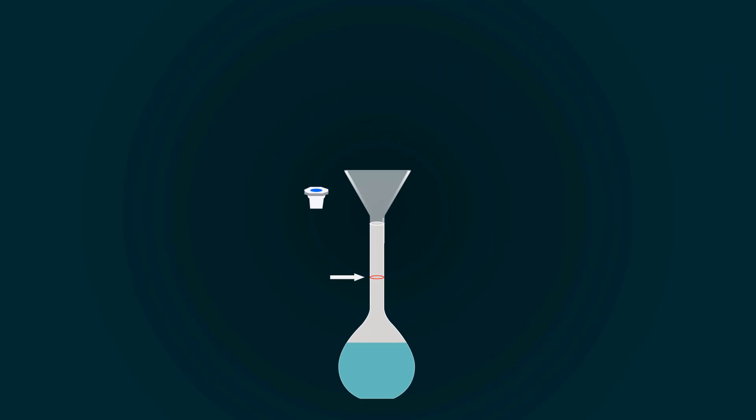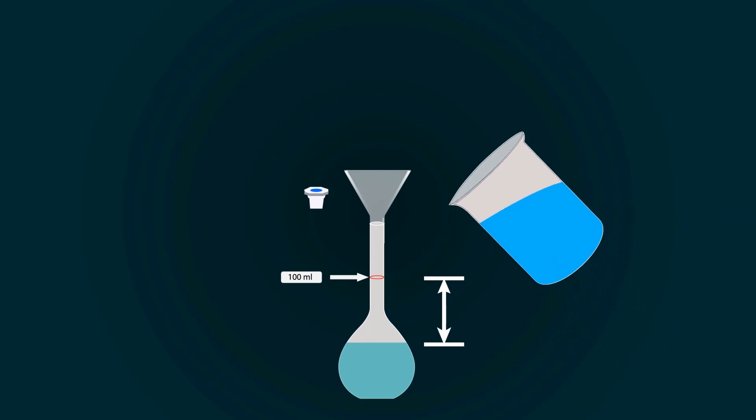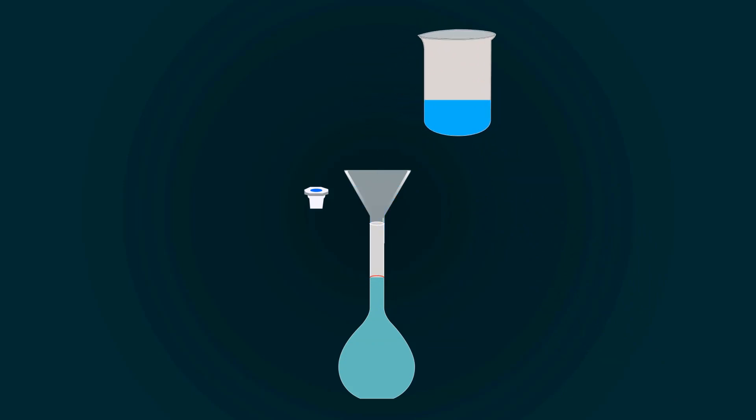You have to fill the volumetric flask up to the 100 milliliters point. For that, you have to add more distilled water. So, take more distilled water into an empty beaker and start pouring it into the volumetric flask.